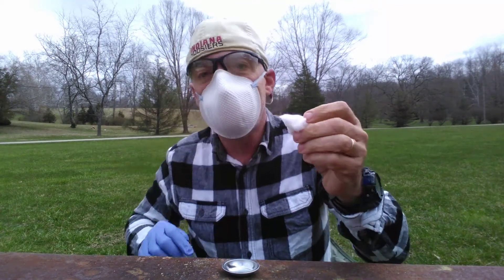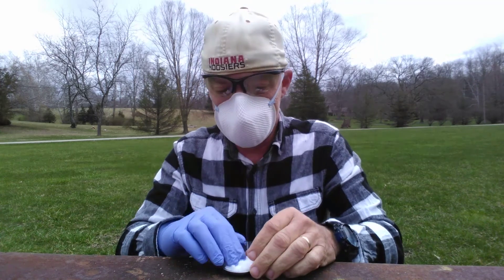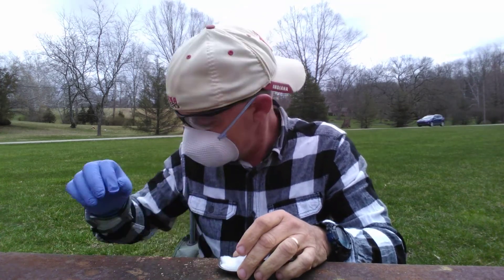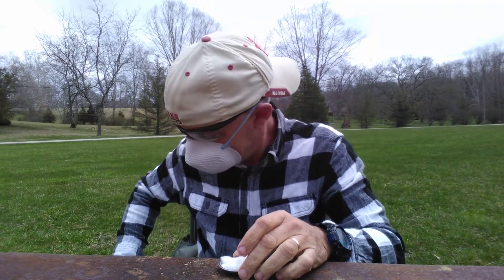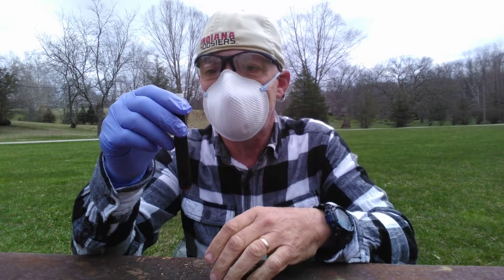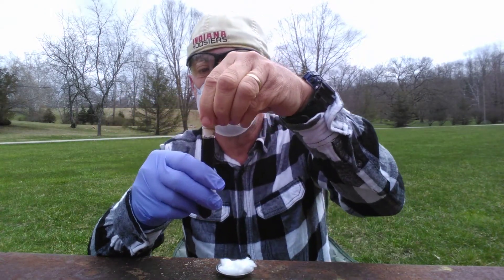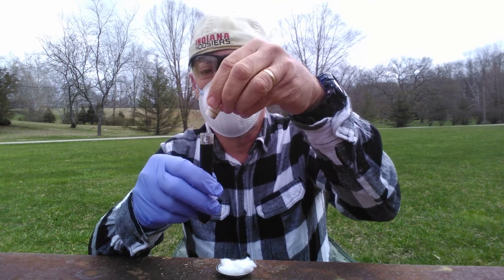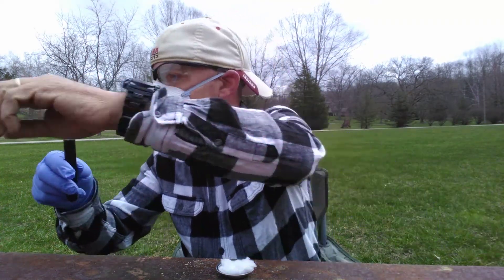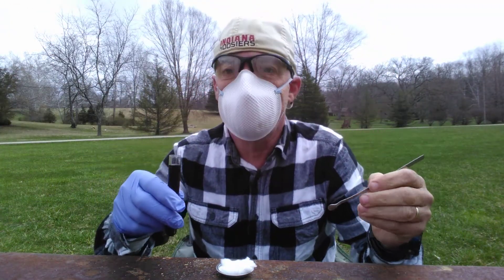So I'm going to take the cotton, I'm going to put it into the container, I'll take the hydrogen sulfate, and I'm going to pour it onto the cotton.